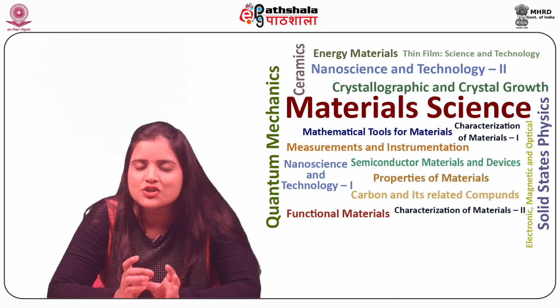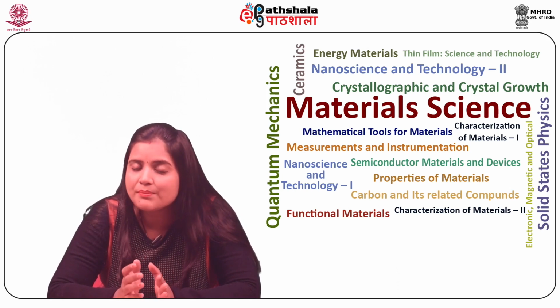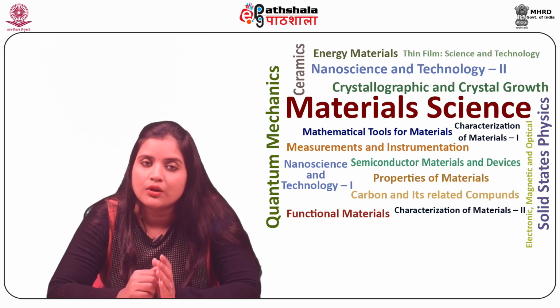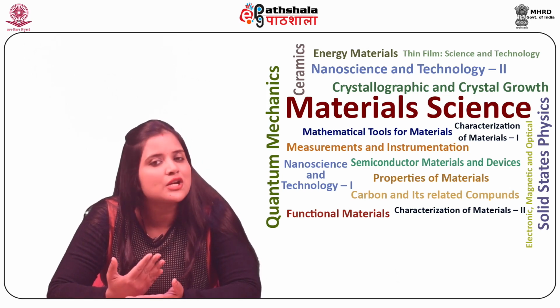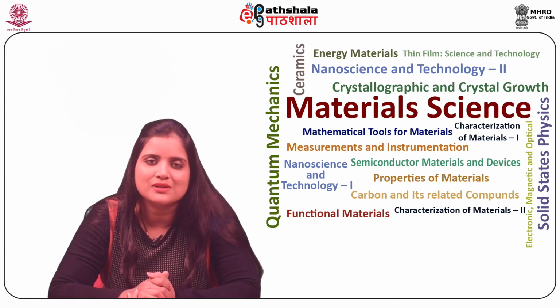Thirdly, this interaction can be employed in manipulating samples to produce nanostructures. Then, another important advantage is that vacuum is not required to examine the samples.